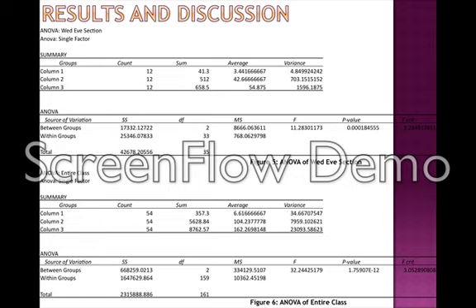The second part of the experiment, room air and exhaled air before and after exercise, was bubbled through 3 separate beakers of pale pink phenolphthalein. Phenolphthalein is a substance that turns clear when exposed to acid. The room air was bubbled into the beaker until it turned clear. The carbon dioxide is an acid. It will turn the phenolphthalein clear. However, the exhaled air before and after exercise was bubbled into the phenolphthalein for 30 seconds. With a transfer pipette, drops of ammonia, a base, were added to the phenolphthalein individually until the substance turned back to the original pale pink.